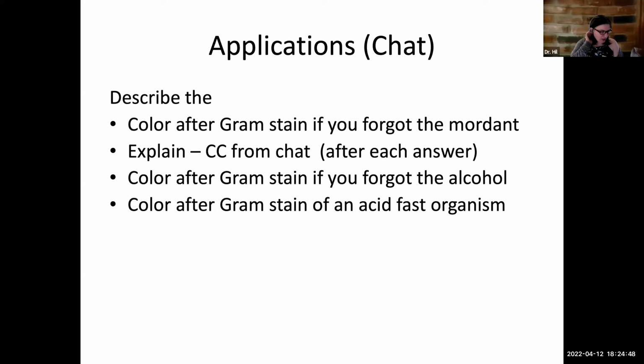Now, if you look online and you ask Google, Google will say, oh, well, the structure of the cell wall is gram positive because they know this from doing structural analyses, which you don't have access to. And it'll stain this, that, or the other thing. But that's really only because as cells age, the cell wall gets a little bit unstable, and so they start to get some pigment sneaking in. But if we had really healthy cells, which is what we would assume, then the most likely thing is we wouldn't see anything at all.